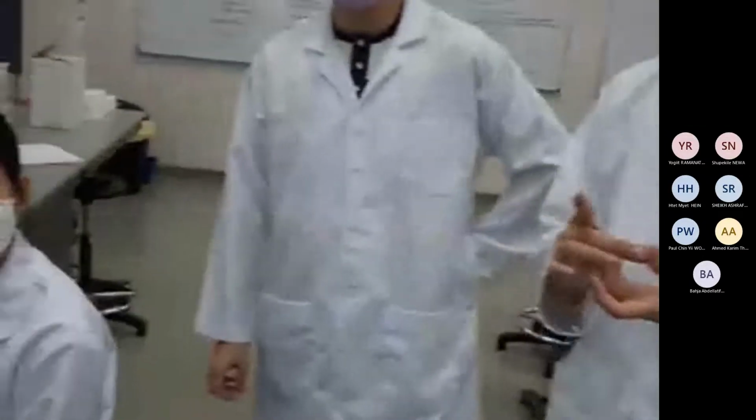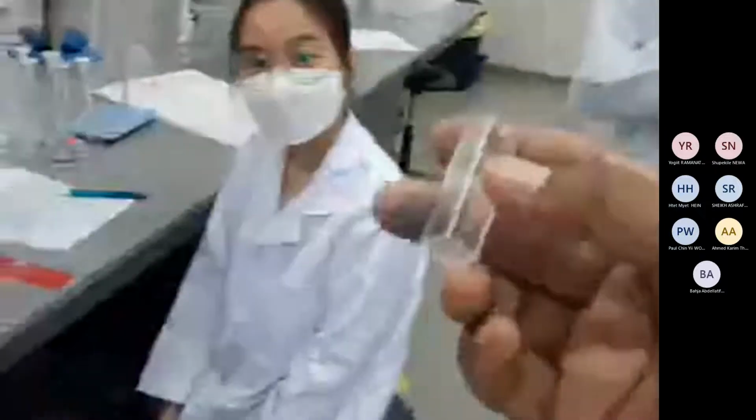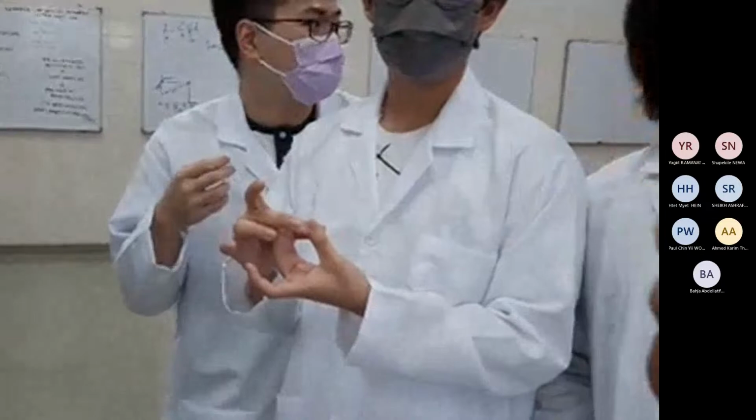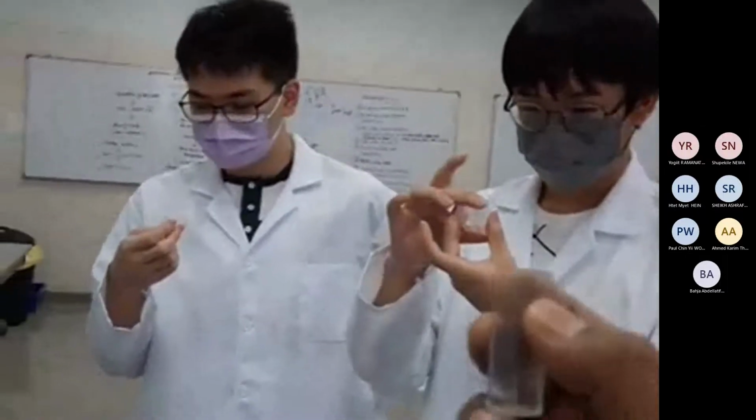Another thing is, you shouldn't touch these two clear sides. Do not touch the clear sides, because even if it does not look like anything, at the micro level our hand is probably leaving some moisture or fingerprint marks there, right? Also, you do not need to fill it up totally to this mark. Keep half a centimeter clear from the top. No need to fill it to the brim, right?